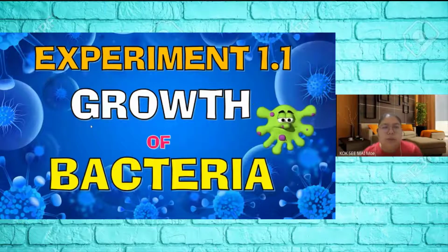Okay, so today we need to explain the growth of bacteria under different conditions, about the cleaners. In the experiment, you put your finger on it. After that, the finger is washed with normal water, and another one with soap. After that, you're going to see the difference in the growth of the bacteria.